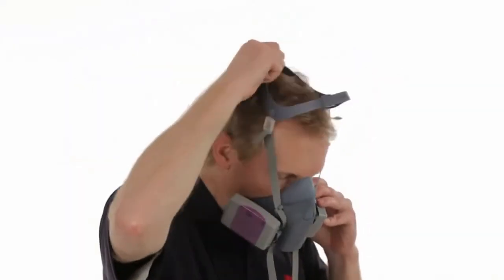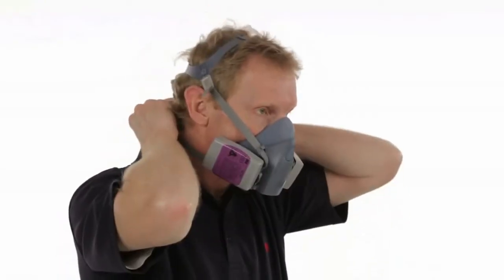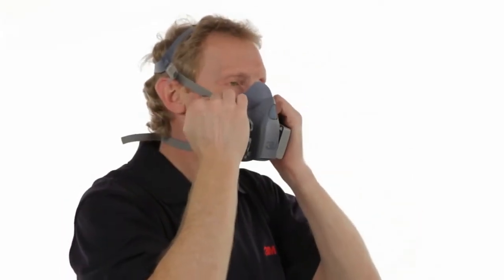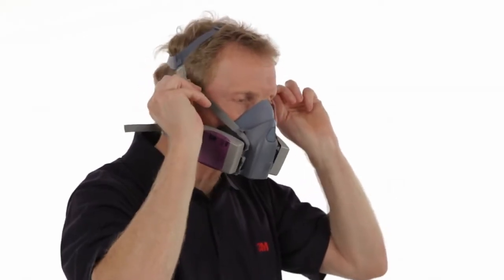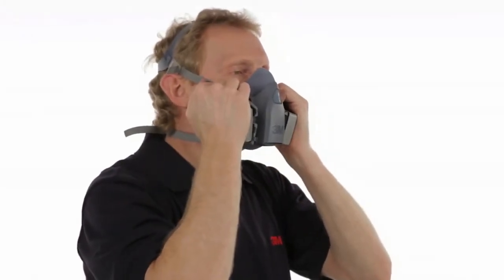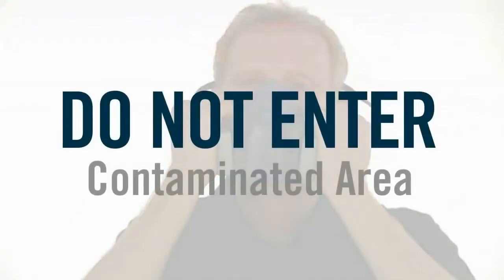If you detect air leakage when conducting either the positive or negative pressure user seal checks, reposition the respirator on your face or readjust the tension of the straps. Then repeat the user seal checks. If you have any difficulty getting the respirator to fit, review the user instructions in the packaging or the fitting instructions provided by 3M to be sure you are putting it on correctly. If your respirator still doesn't fit correctly, see your supervisor.